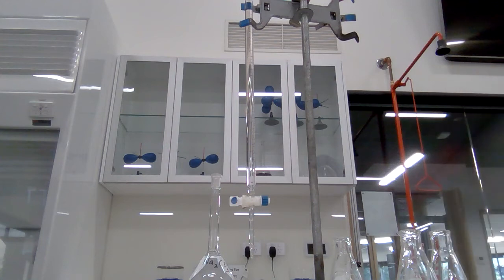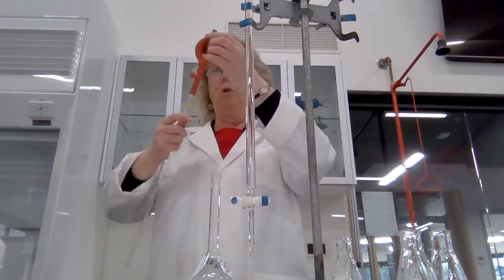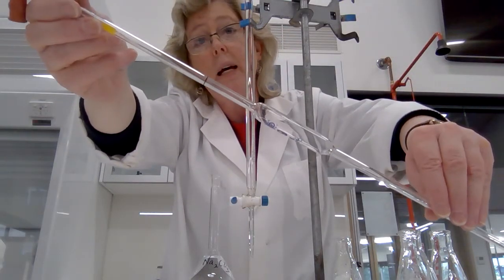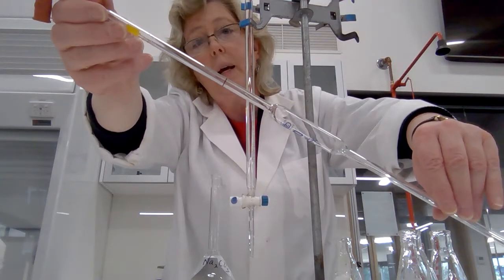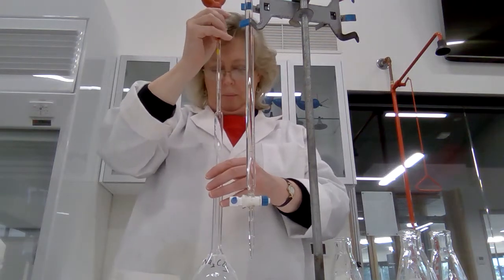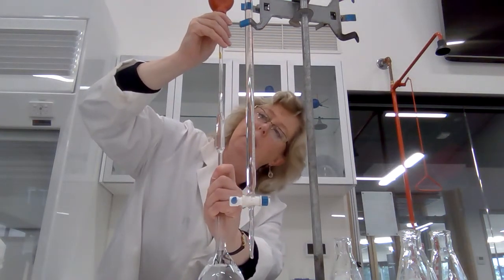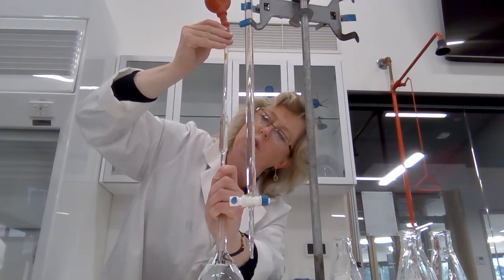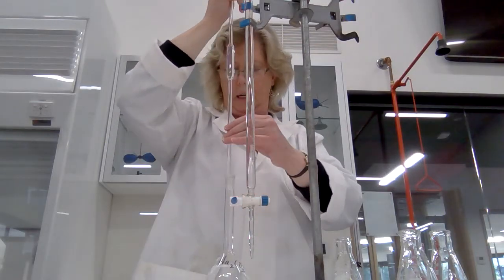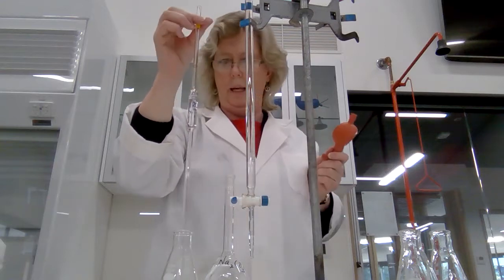Now I'm going to use the pipette filler to get 20 millilitres. Like the volumetric flask, the pipette has a line — a brown line — that indicates exactly 20 millilitres. When I fill it to the line using the pipette filler bowl, I can take the liquid right up to that line. I have to be careful at the end to make sure I end up right on the line. I'm a bit over, so I'll go down a smidge — perfect. I'm going to put that into my conical flask.